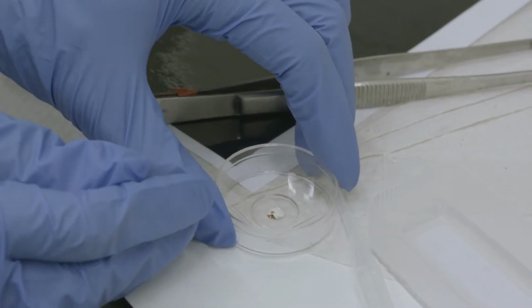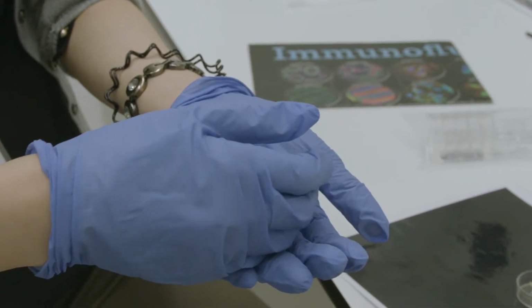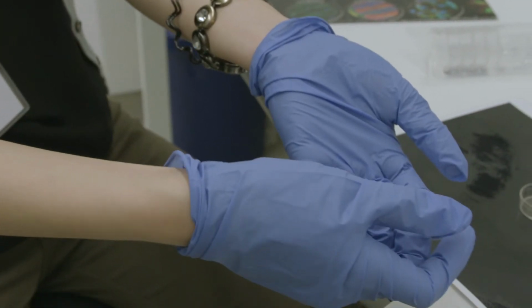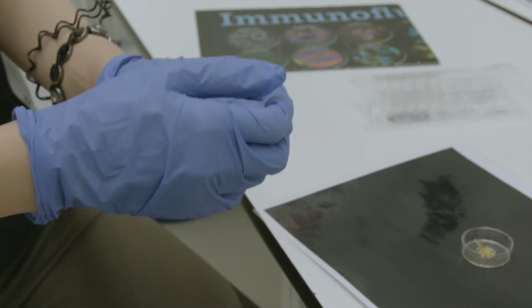In this way, the sample will always be immersed in BABB, and because BABB doesn't evaporate so fast, you can even keep it for several days and it will not evaporate. It's absolutely fine for your imaging.